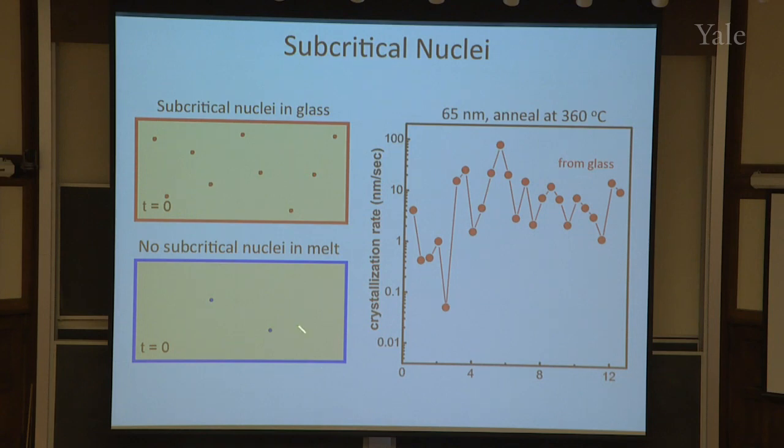So now, if I have a lot fewer, I should expect much smaller fluctuations, right? And perhaps the growth rate, the rate at which crystallization happens, should also be lower because I have fewer of these. And that's actually what we find. Here, the blue is for this case, and this is the measurement. You see that the crystallization rate for the blue case is lower than the red one. And this is in a log scale, meaning this difference is actually about 100 times. This is a big difference. So indeed, there's no fluctuation.